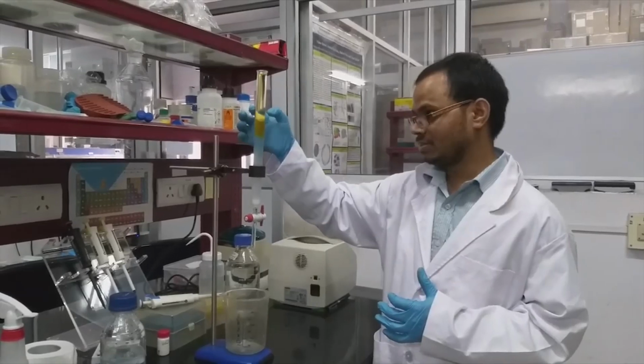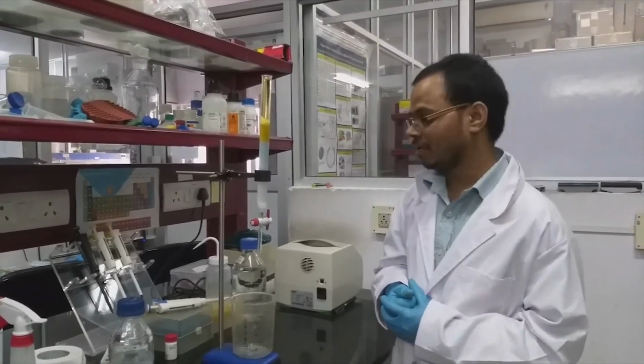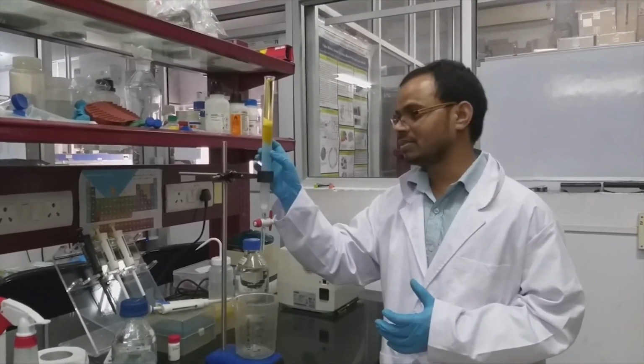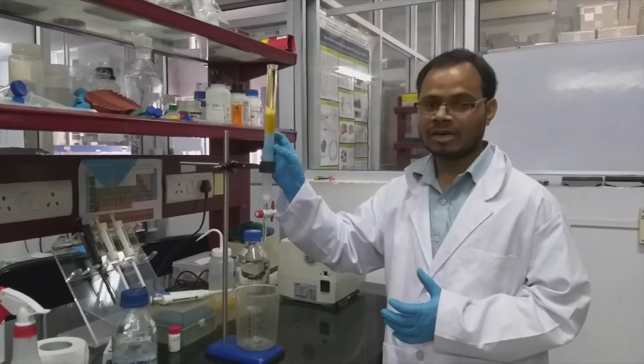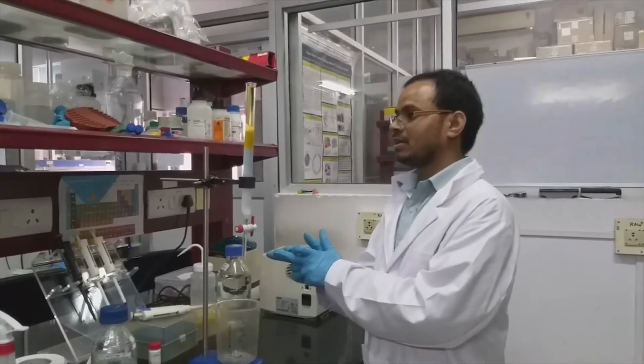When the buffer comes to an end, you have to replenish with the buffer, and you have to collect the fractions. As you can clearly see, this blue dextran band is eluting out. So you have to collect this and check for purity.